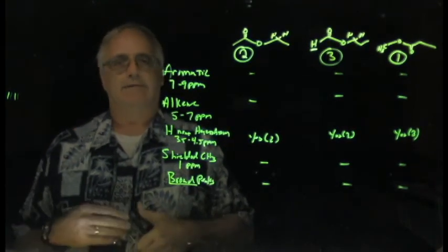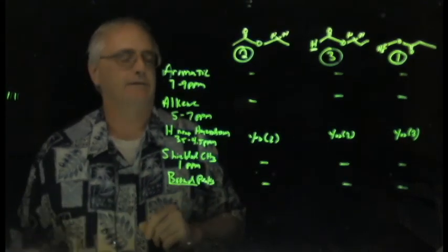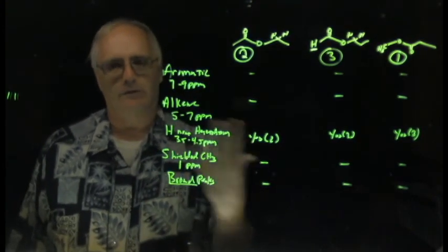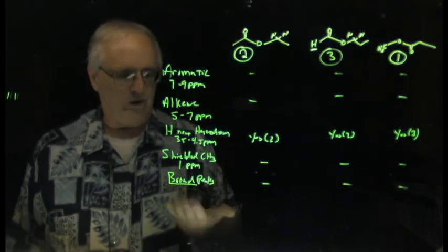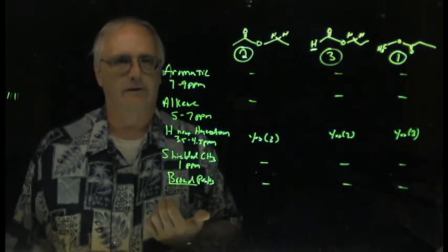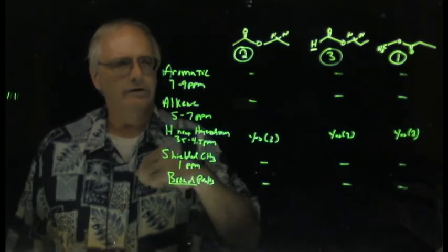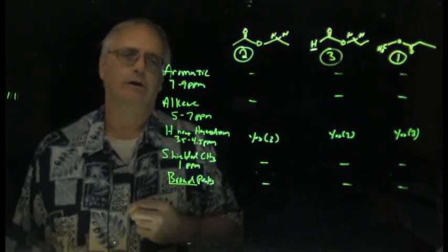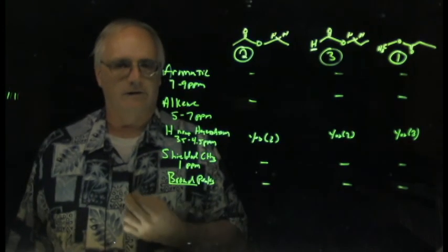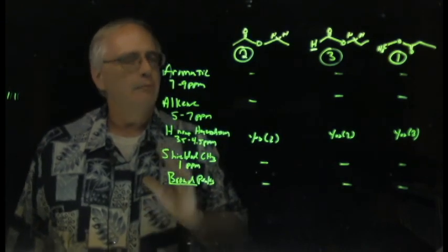So keep all that stuff in mind. A lot of times, students find learning NMR to be difficult. I understand why. It is a complicated subject, but at least in the early going, when you're confronted with a spectrum and asked which molecule it is, these 5 best friends can really help you start picking out molecules, picking out choices from a bunch of spectra, what structure goes with it. And once you get comfortable doing that, then you're in a much stronger position to move on to the greater skills of looking at the spectra and determining from just that information what the actual structure is.